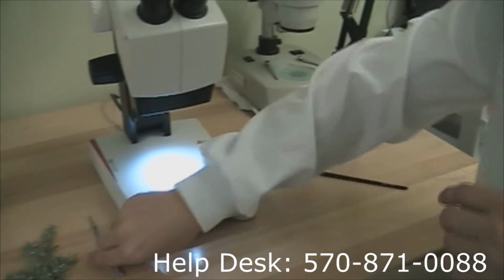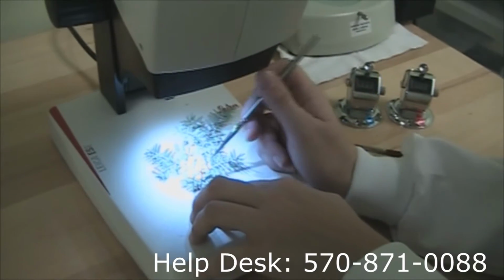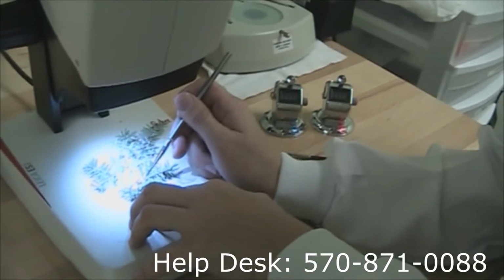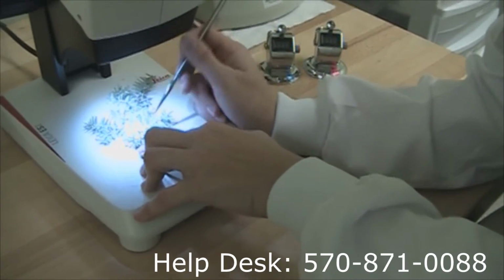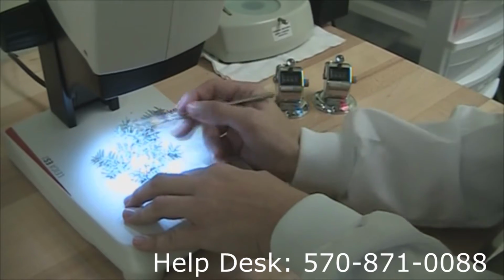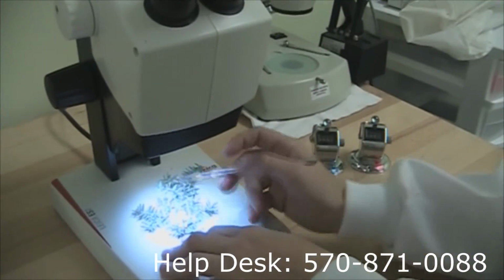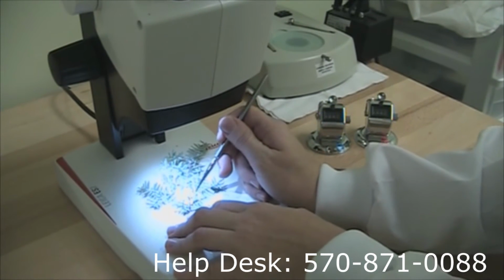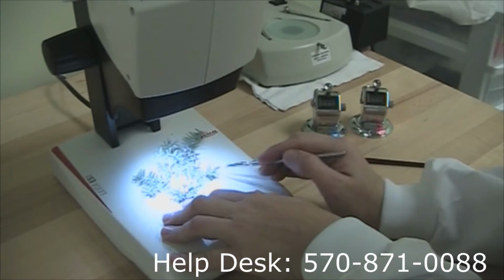So just so that you can tell here, we use this to open up the egg sacs. In here there are several hundreds of eggs, probably in the realm of about 20 per puff. And then you can zero in through the microscope. Unfortunately, we can't show you what it looks like, but an adult adelgid probably has about 20 eggs in each one of these sacs right now.